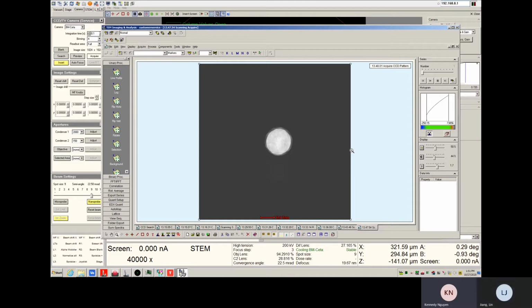Okay, you want to do a little bit of practice on this one? Okay, cool. Go ahead. All right, so I want you to get three diffractions. First, I want to see nano diffraction. You already took that diffraction, right? The second one, microbeam, you have already done that.